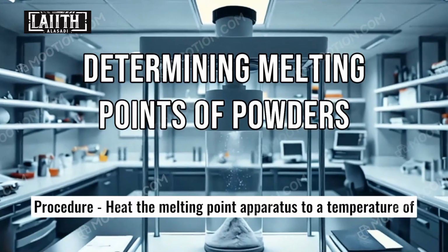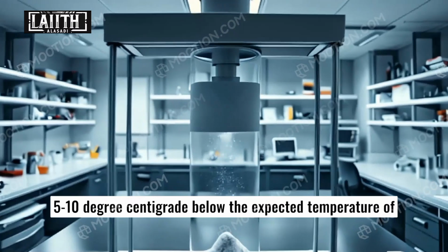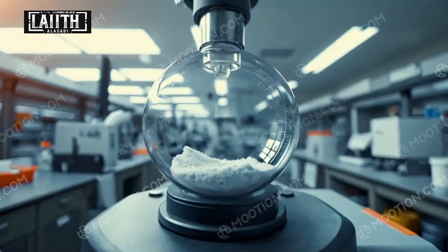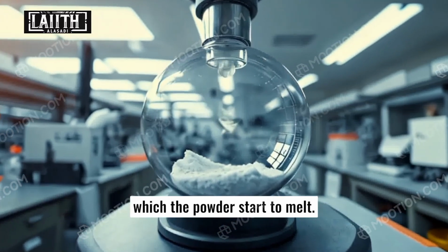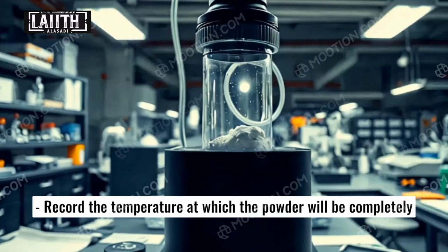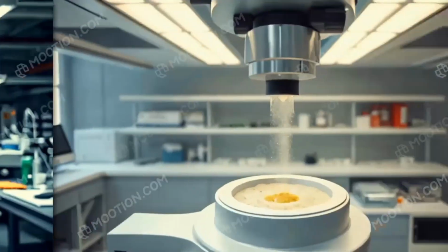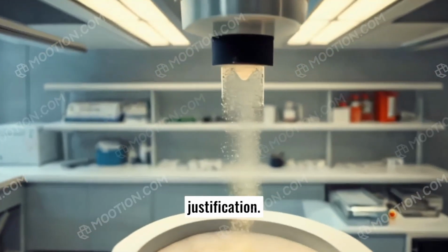Procedure. Heat the melting point apparatus to a temperature of 5 to 10 degrees centigrade below the expected temperature of melting, and adjust the heating. Watch from the lens of the apparatus and record the temperature at which the powder starts to melt. Record the temperature at which the powder is completely melted. Determine which powder is the pure one with justification.